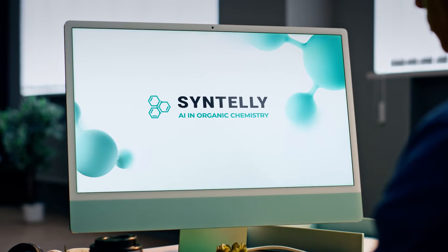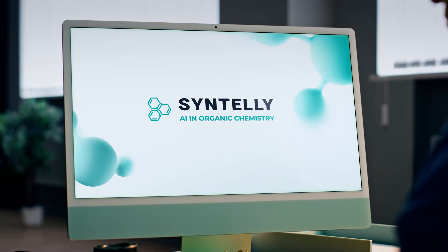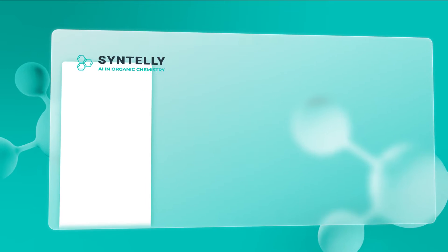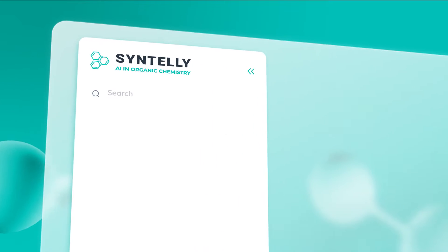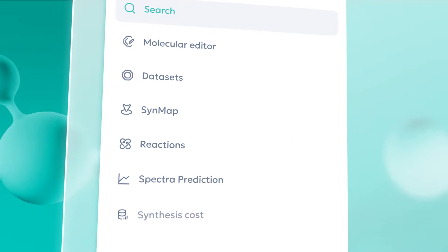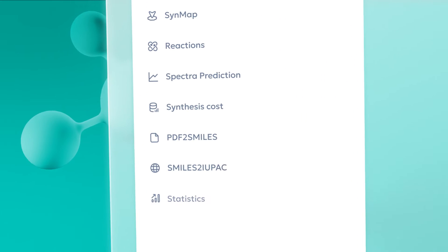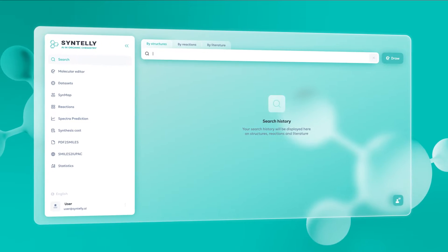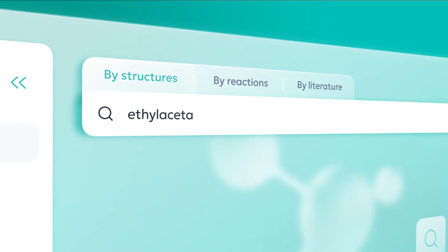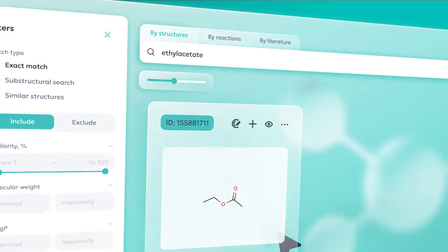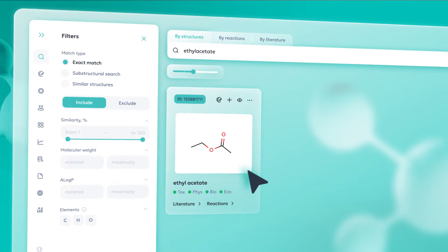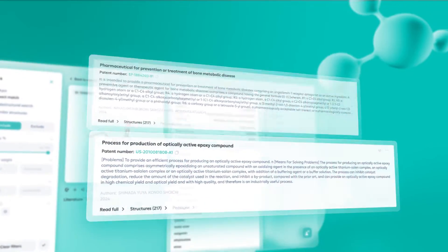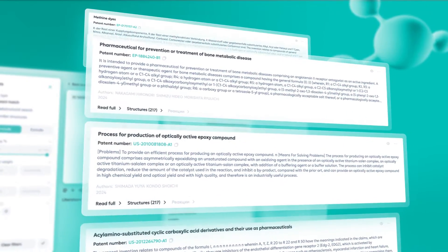Sinterly allows you to speed up the search for the necessary information by 20 times, combining the functionality to automate all typical tasks in the field of organic chemistry. This service is easy to use. In the Sinterly database, you can find the maximum amount of information about chemical compounds and reactions with links to literature sources.